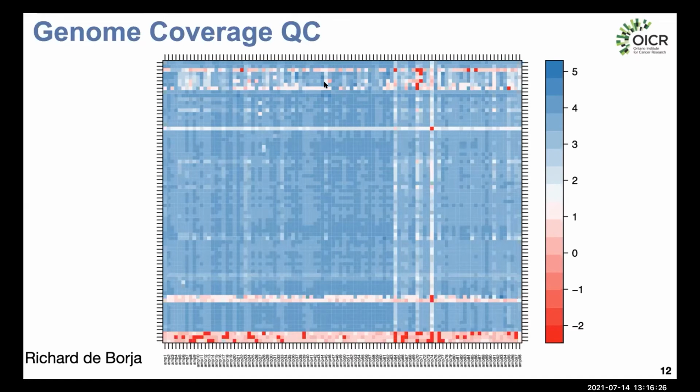But we can also see patterns in the amplicons as well. For example, this column is amplicon 64, which has lower coverage than the other amplicons on the sequencing run. Also, amplicons 70 and 74 had consistently lower coverage. So this shows us that these are the three weakest amplicons, and it might lead you to think that you want to tweak your PCR conditions to try to improve these weaker amplicons. This just gives you a quick one-image summary of how well each amplicon performed across all of the samples on your sequencing run.